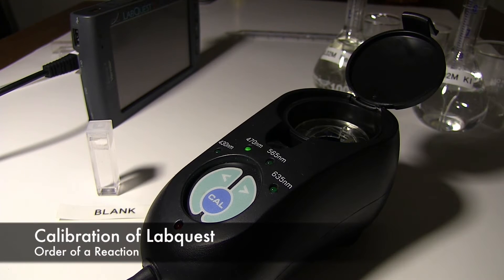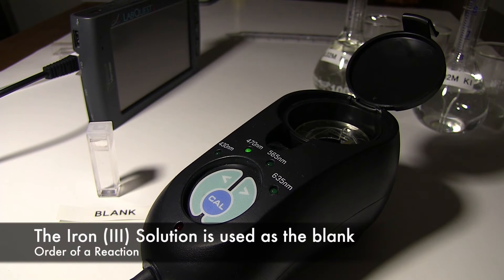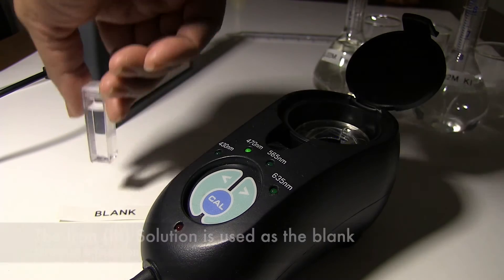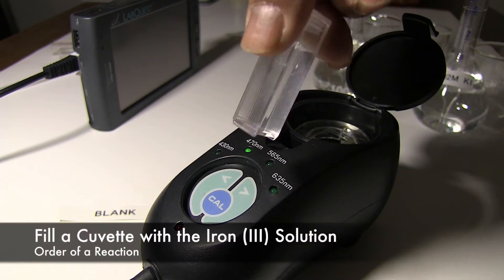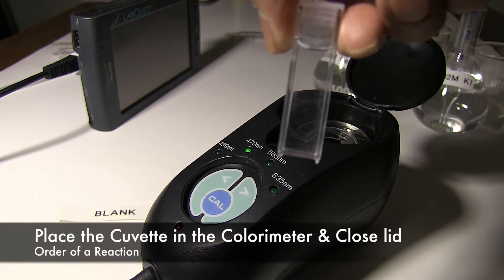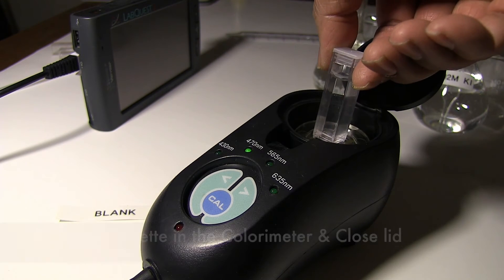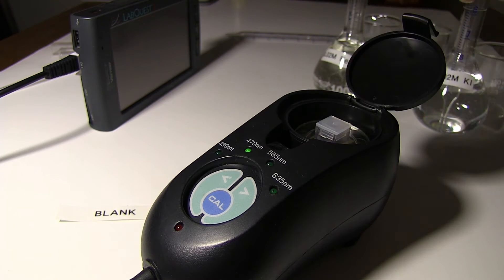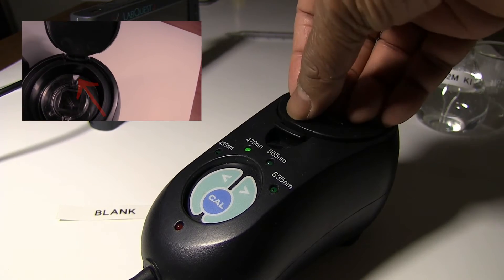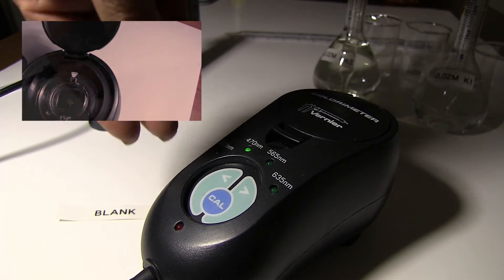To calibrate, we will use the 0.02 molar iron 3 solution as the blank. Fill the cuvette 3/4 with the iron 3 solution, close the cuvette, place it in the colorimeter such that the clear side of the cuvette faces the white triangle on the colorimeter.